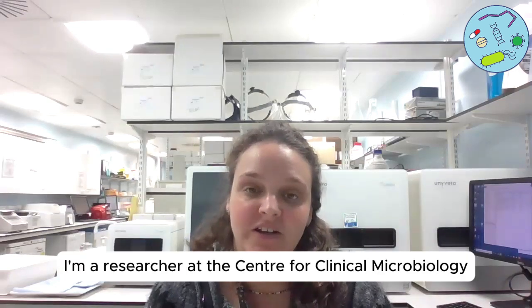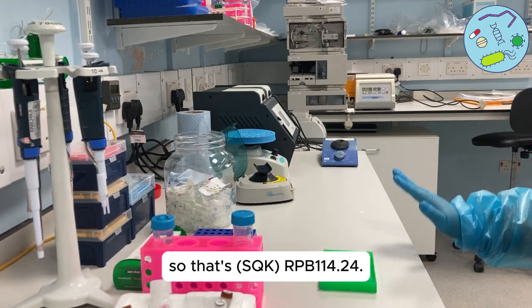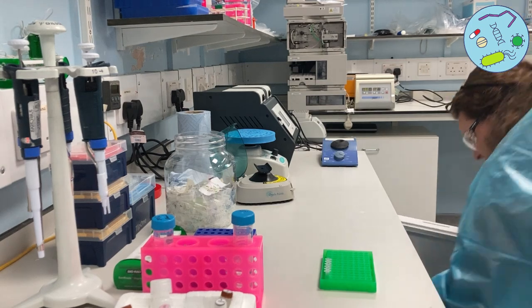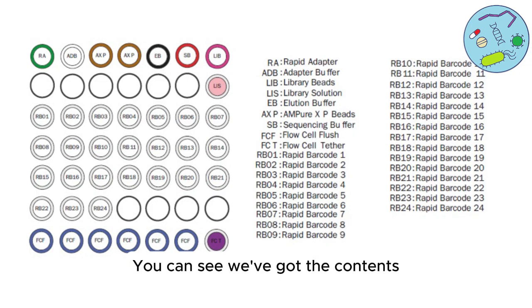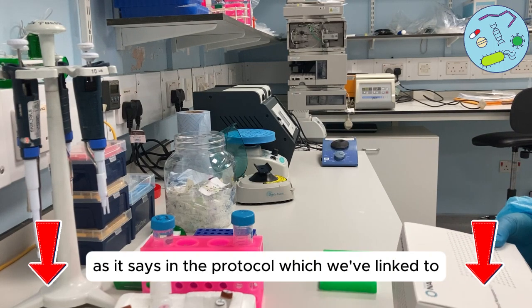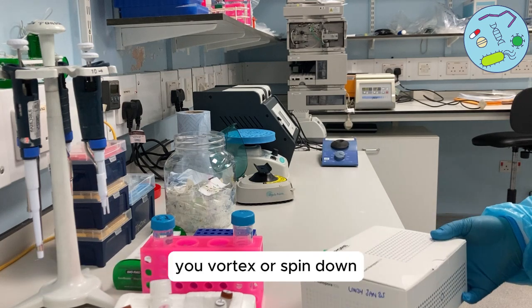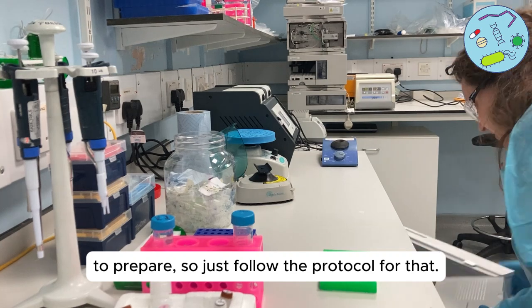My name is Cindy and I'm a researcher at the Centre for Clinical Microbiology at UCL. Today we're going to be doing the rapid PCR barcoding kit, that's RPB114.24. You can see we've got the contents — these are the various different tubes — and we're going to put those on ice. As the protocol says, vortex or spin down the reagents, so just follow that.